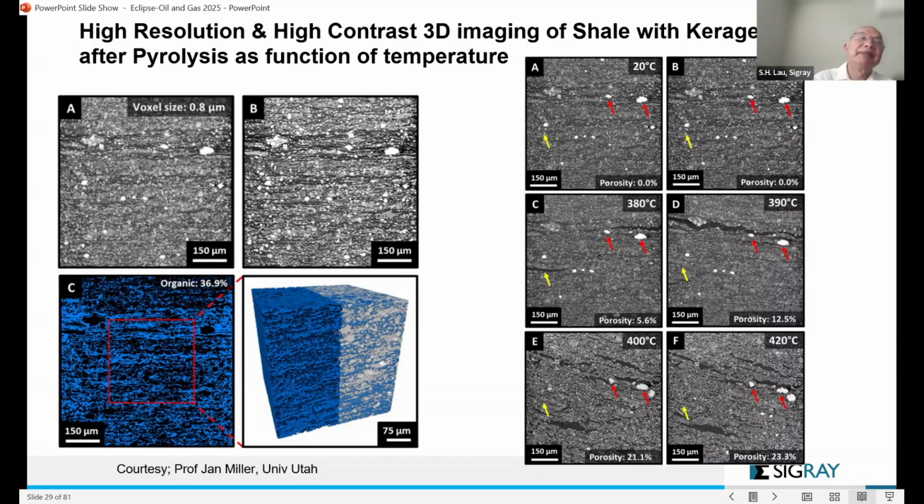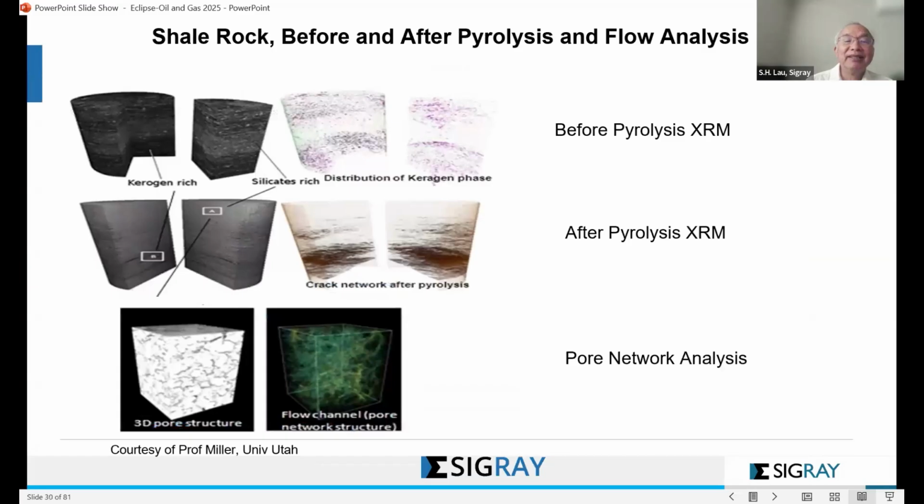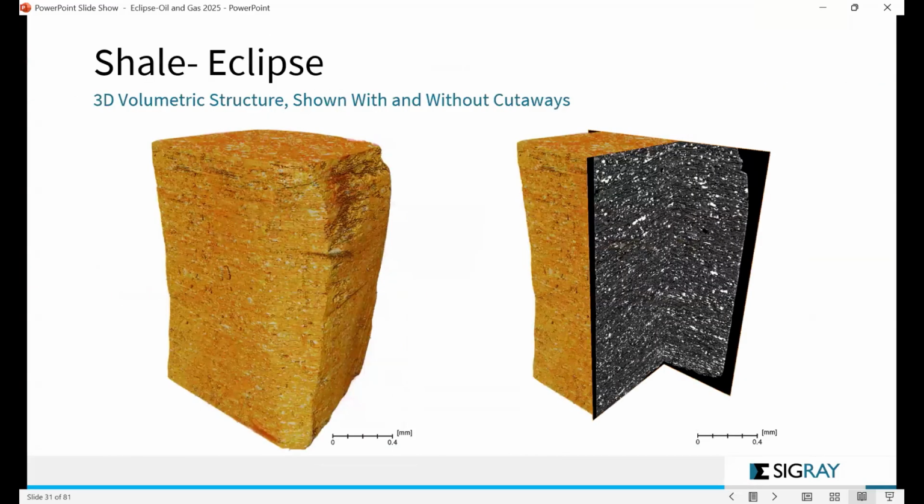That means you sample, let's say you look at your shale, right? Using your microscope or whatever, you can see that, okay, this is kerogen rich. Then you extract maybe 1 millimeter out of that. Okay, I see. So this type of experiment you can do. But then you will need to have high resolution. Okay, thank you, sir, for your explanation. It's clear for me. Thank you.